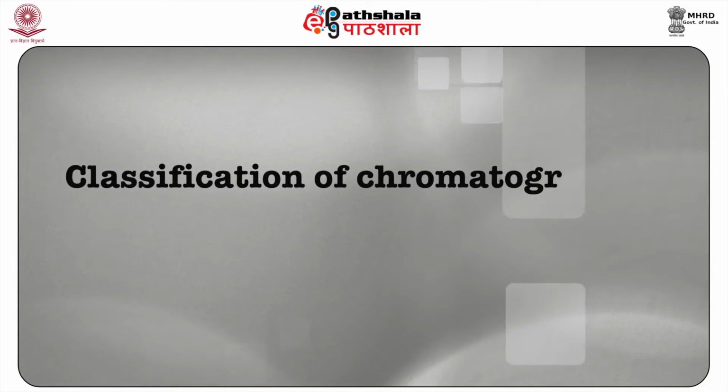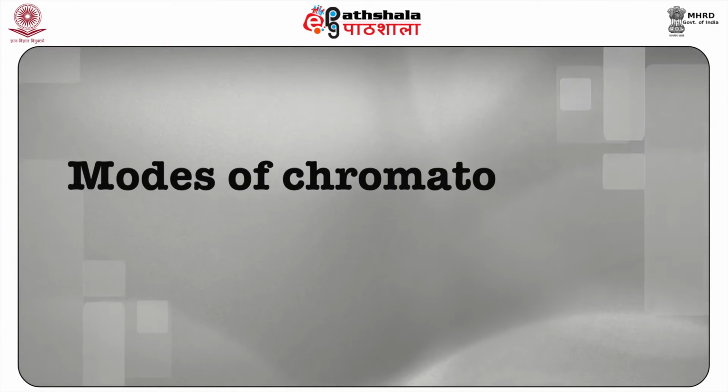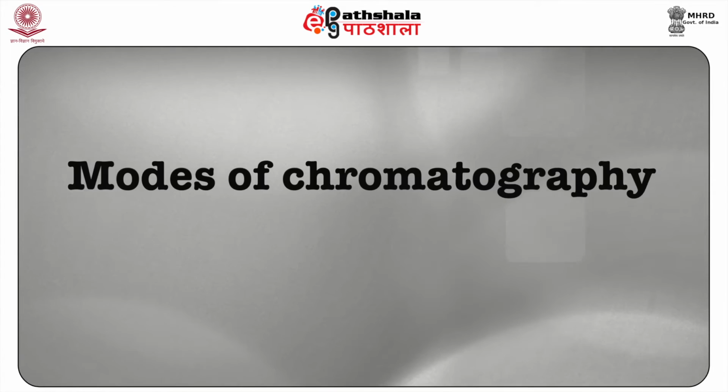So, after having described to you chromatography as well as partition chromatography and various terms which are used in chromatography on a daily basis, let us classify chromatographic techniques. The various chromatographic techniques have been classified depending upon the forces or the interacting phenomenon between the solute molecules as well as the stationary phase. Let us now discuss the modes of chromatography.